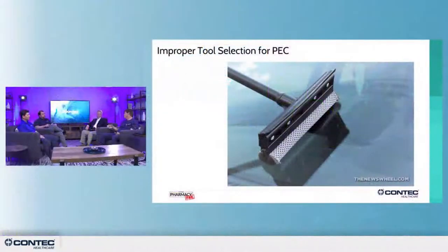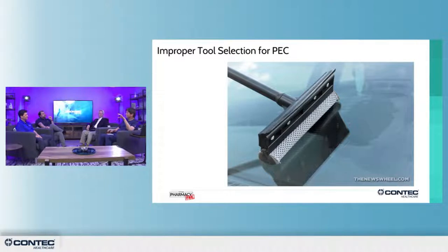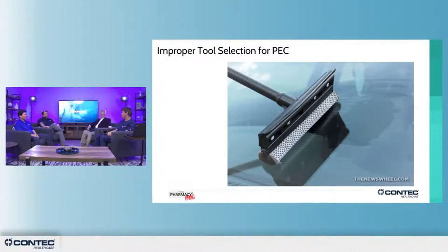Absolutely. So we've talked about making sure that we've got dedicated supplies in the clean room, and we talked about having the right PPE, but also sometimes we've seen improper tools that people are using inside of a PEC or an SEC. I visited a hospital a couple of years ago, and I grabbed my sample bag. I was going to show them our easy reach tool for cleaning a primary engineering control. And the guy said, "Oh, I've got that settled." And he was using, you know when you go to the gas station and you've got mosquitoes all over the windshield and you get out that little scrubber thing, he was using that to clean his primary engineering control. It had a wooden handle on it, and you do not want to use a wooden squeegee to clean your window. The wooden handle is not appropriate for that environment, and the sponge would be a harbor point for bacteria, so you wouldn't want to use that.